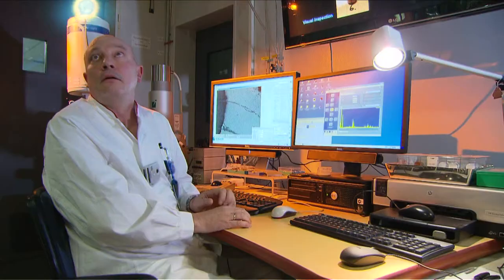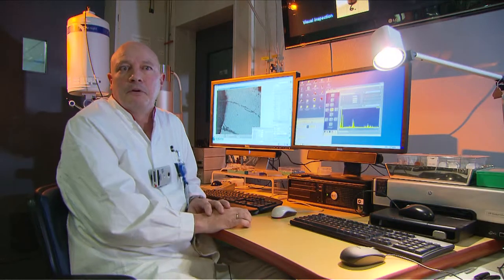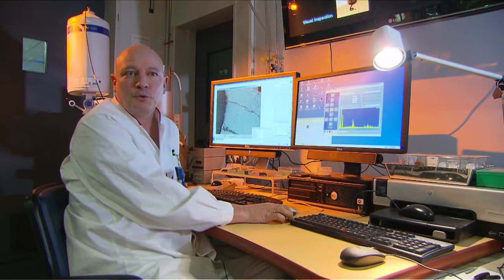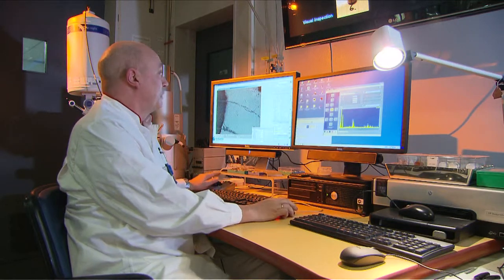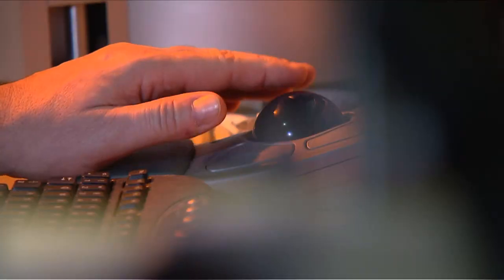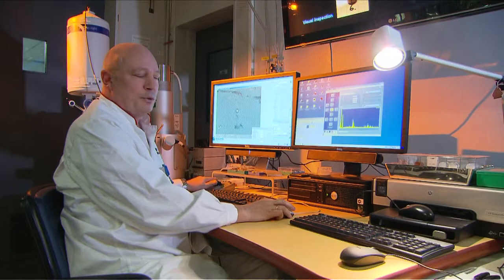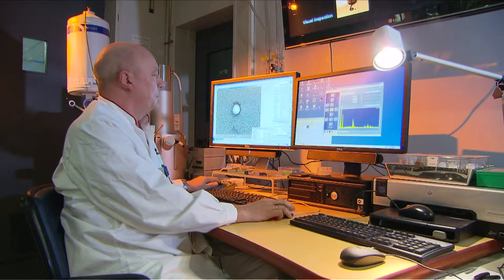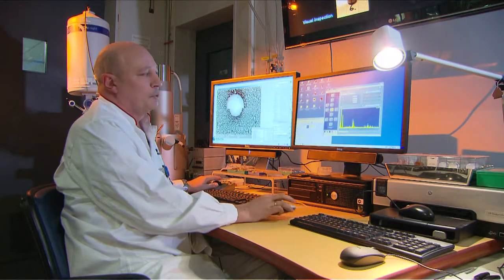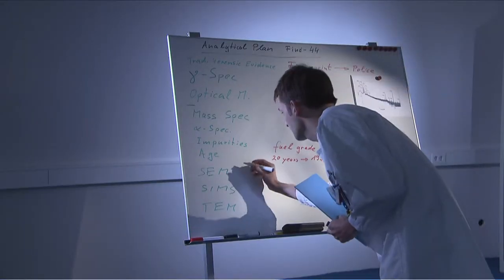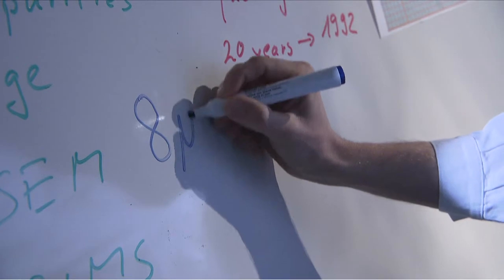The next clue comes from Bert Kramer. So this is an SEM, a scanning electron microscope. Here the sample surfaces are scanned. We try to find out the morphology of the sample by visually enlarging and then photographing it. And we can also determine the chemical composition of the sample. The particle size is 8 micrometers.